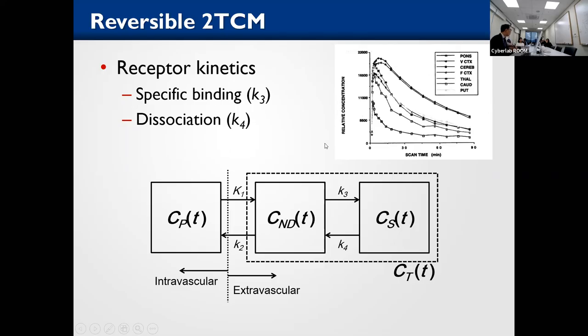If we want very high time resolution, it means the time frame is very small, and that means there is a very small amount of traces. It means high noise levels. So to get enough statistics, we need to make the frame very big. It means the time resolution is very low.